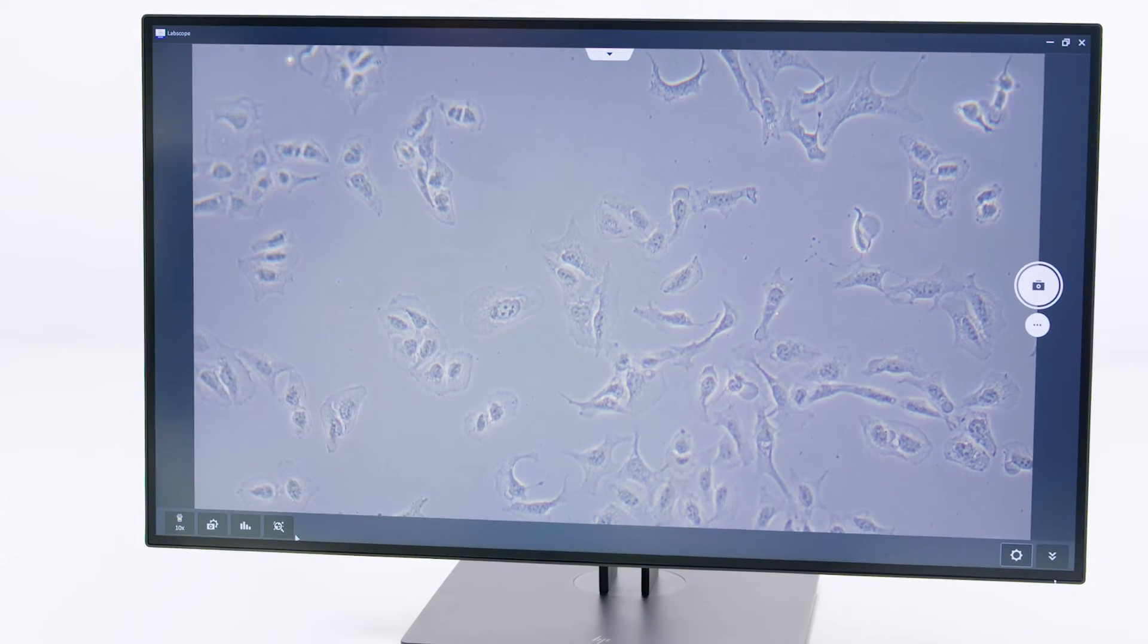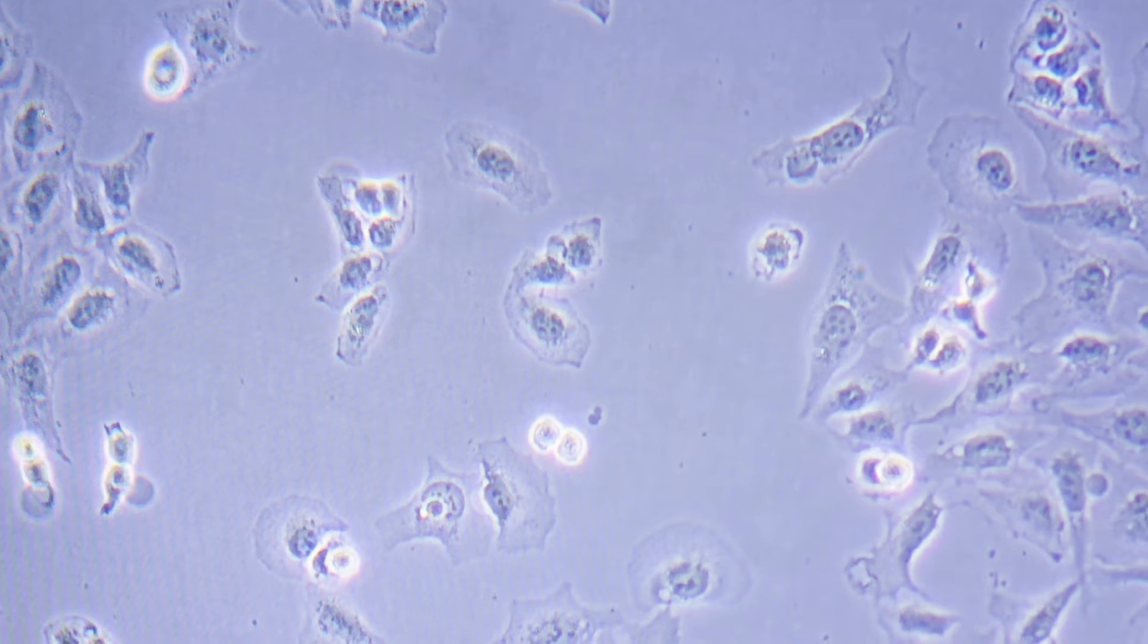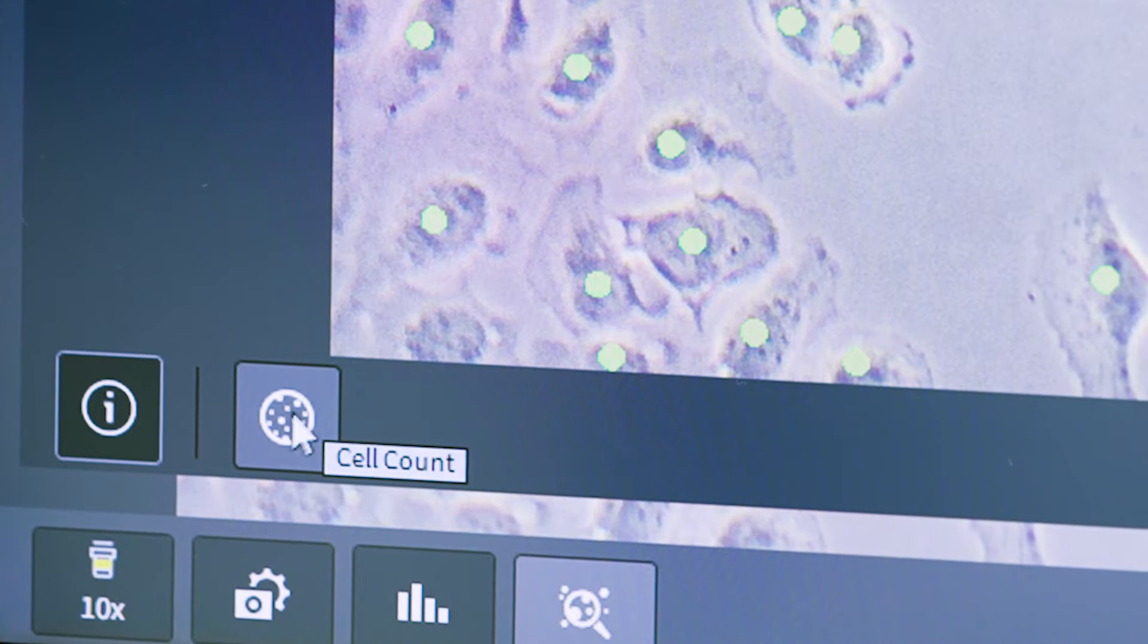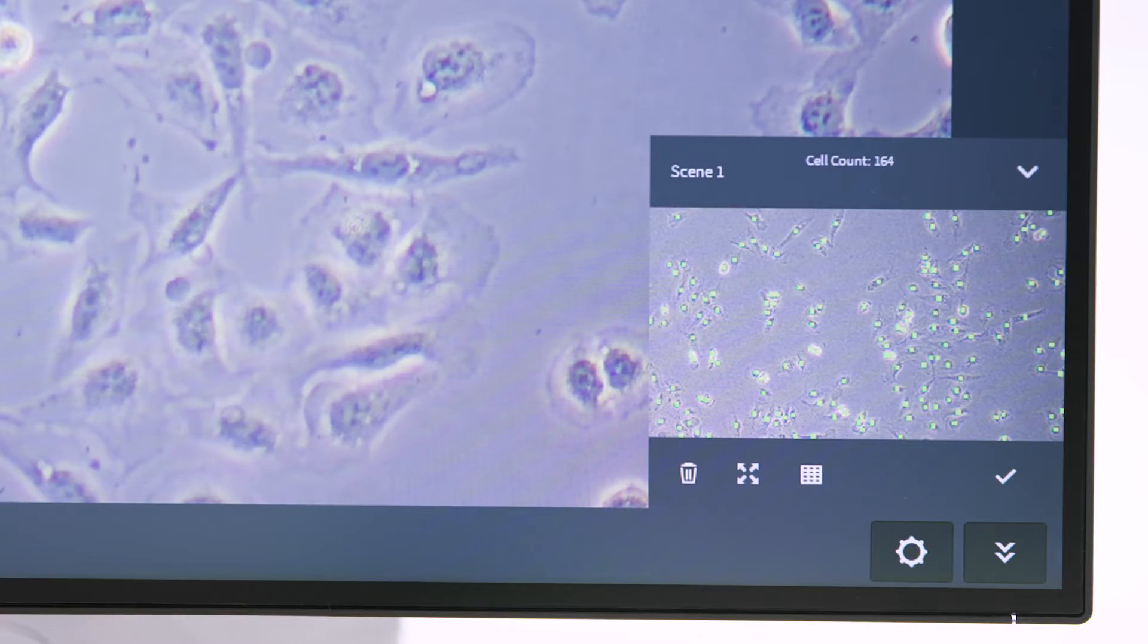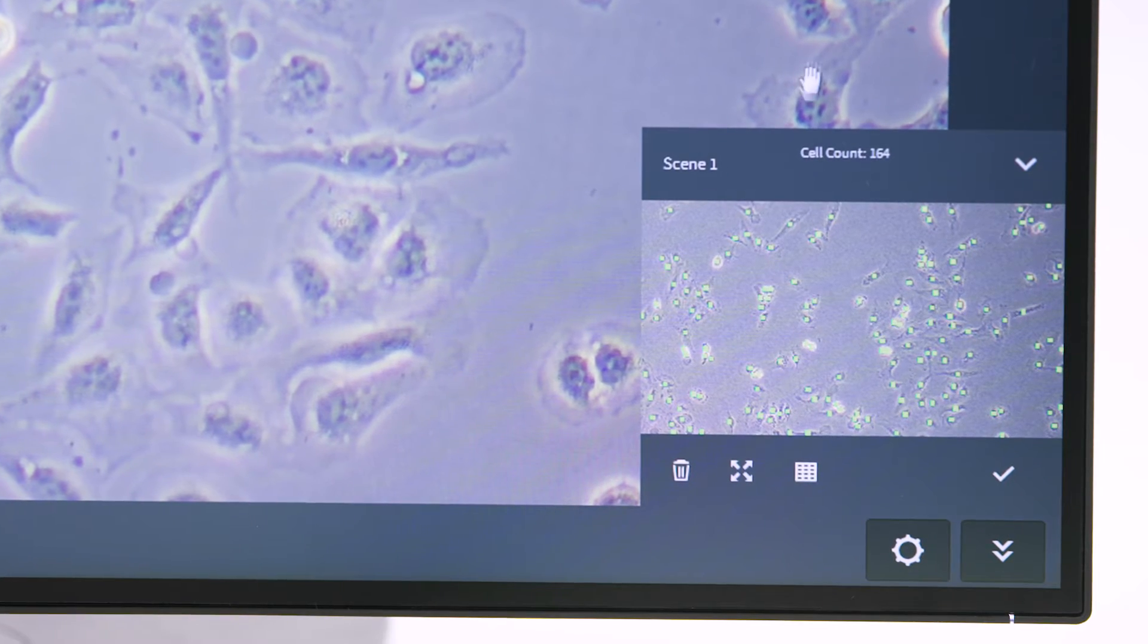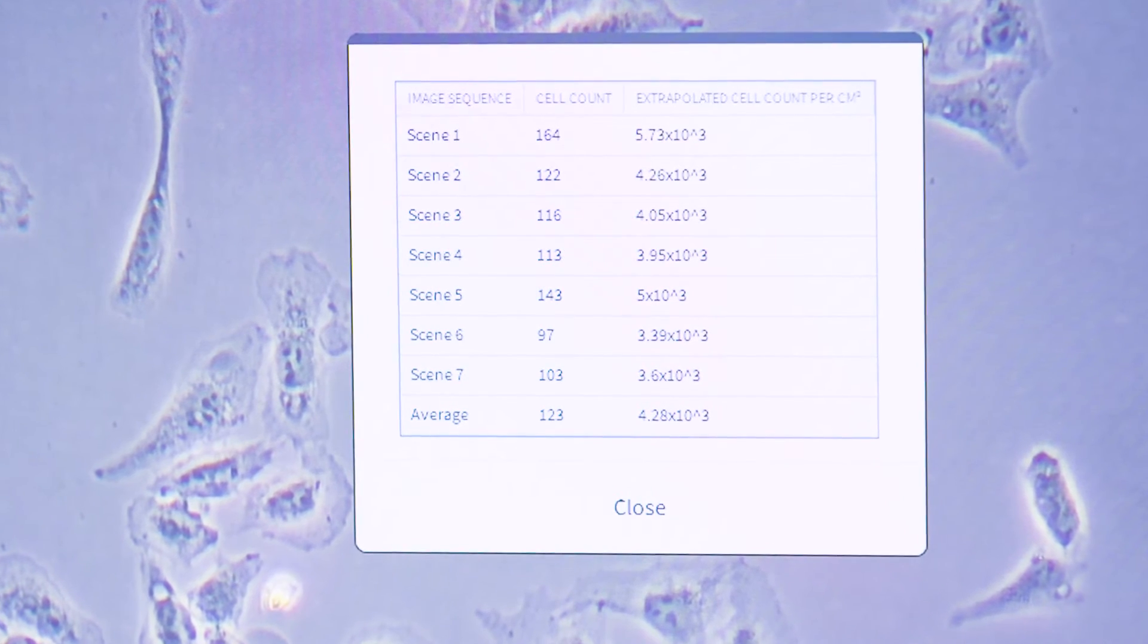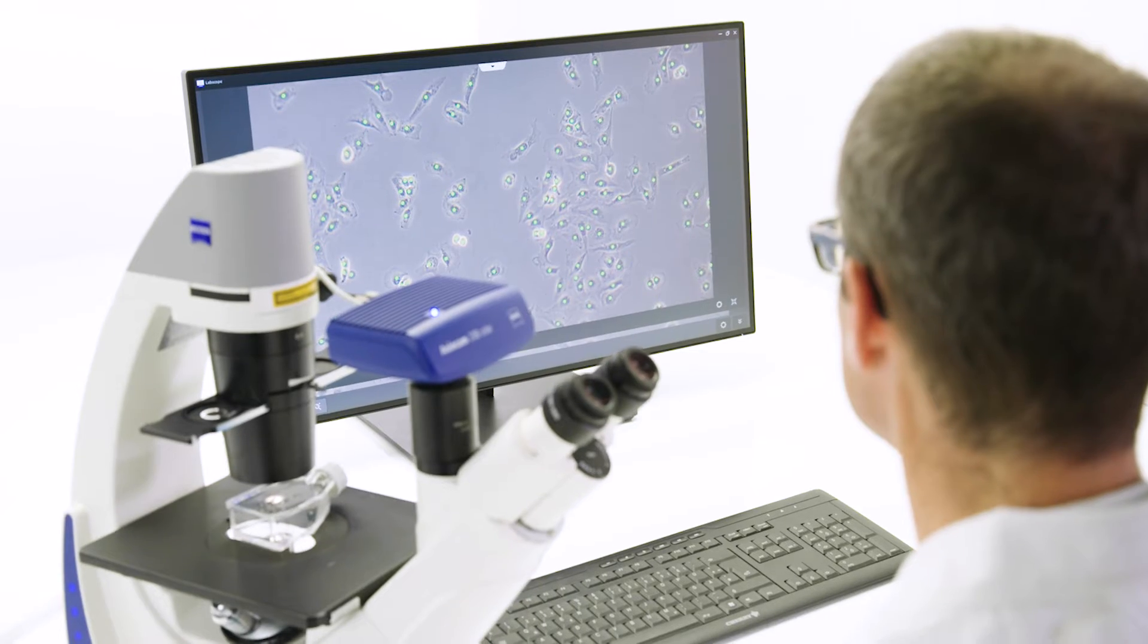Manually done, this can be a rather time-consuming, labor-intensive process with error-prone subjective results. Opt for the Zeiss LabScope AI cell counting module and start to improve the quality of your cell culture today. Make your experiments more reproducible.